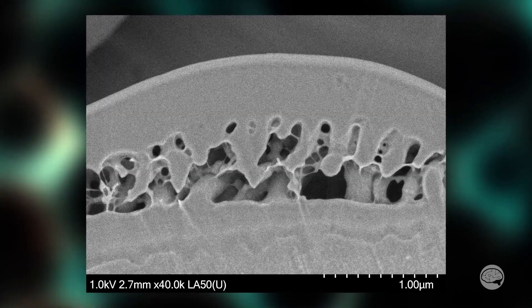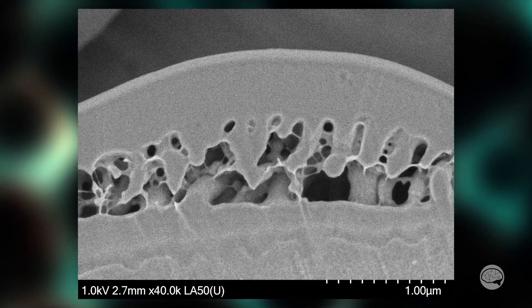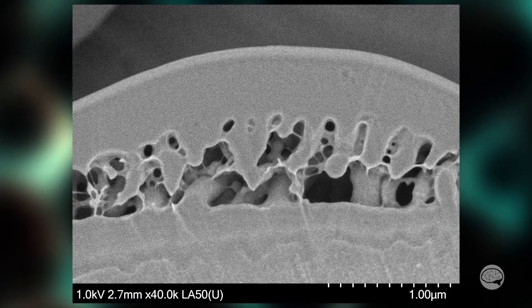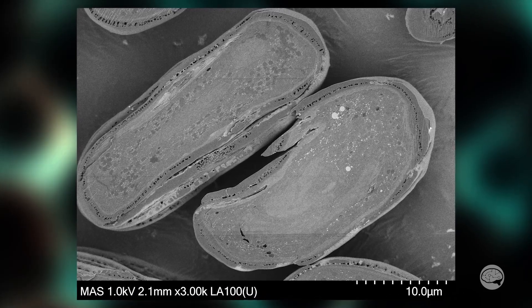Starting from the outer shell, we can see some very delicate structures between it and the juicy insides. The hard outer shell is also approximately one micron thick. In the bulk of the sample, we can see several interesting-looking structures.